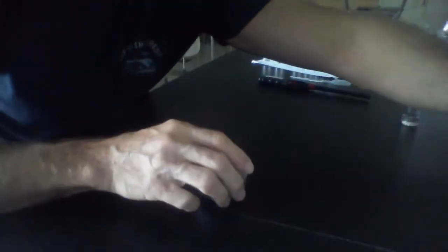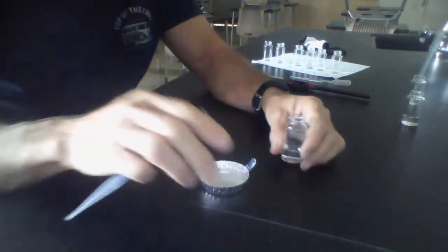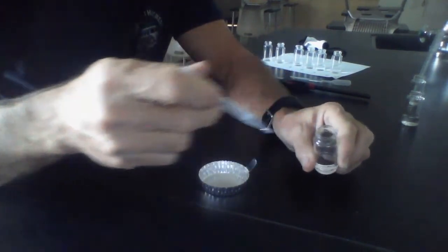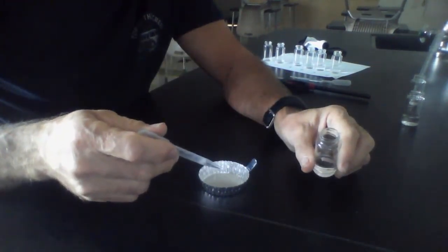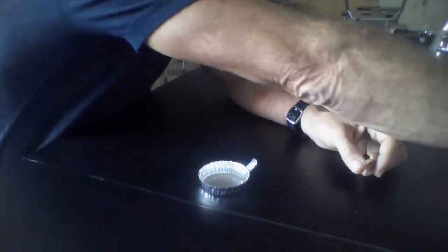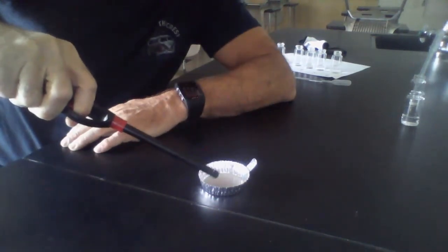I think I can do these continuously. Clean pipette, fresh weighing boat, aluminum, and 5 drops. 1, 2, 3, 4, 5. Setting it aside, igniting. 3, 2, 1, go.